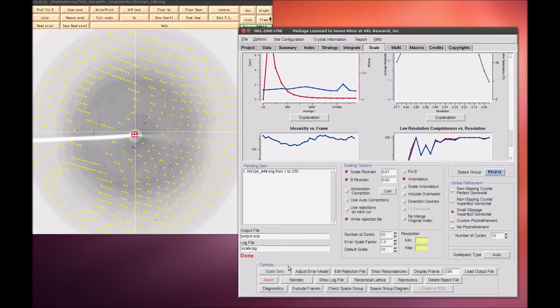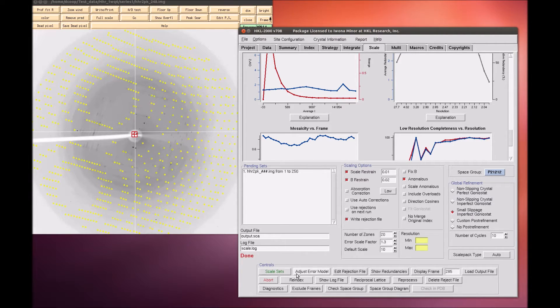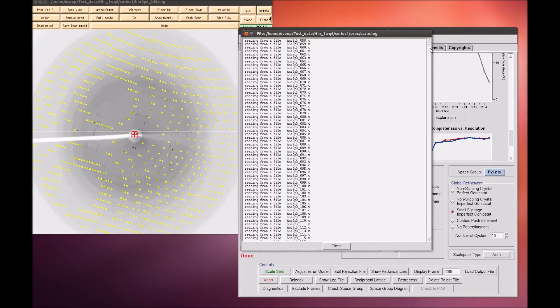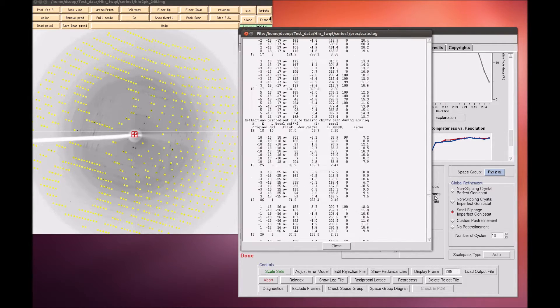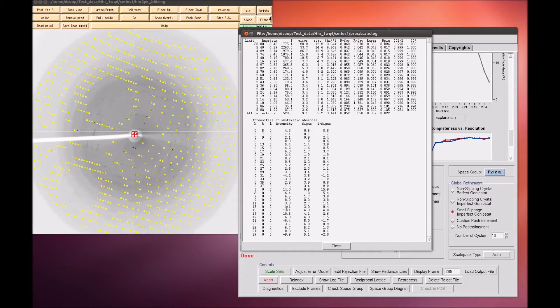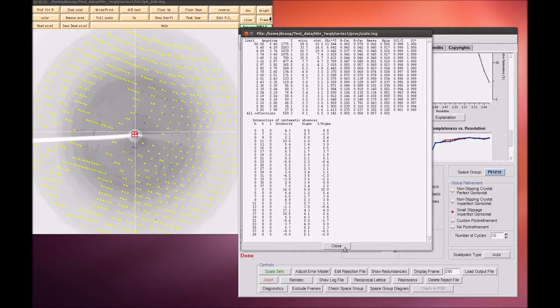I like to check the log file to verify the reindexing process. At the end of the log file is a list of all reflections that should be systematically absent from the selected space group. In this case, all of the listed reflections are indeed absent.